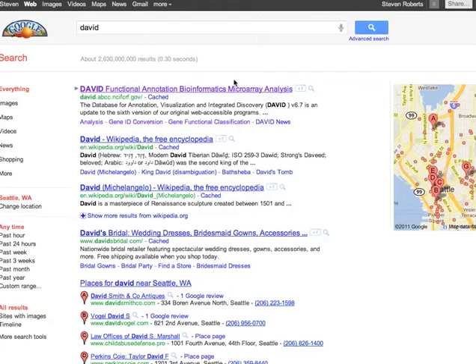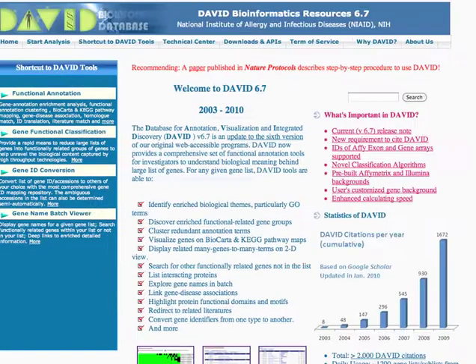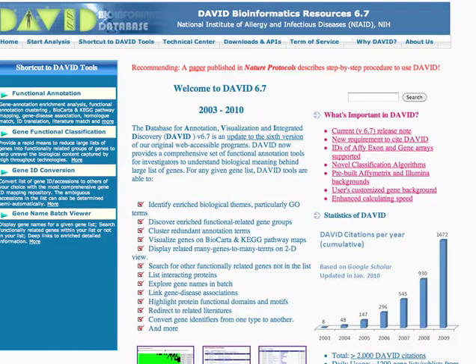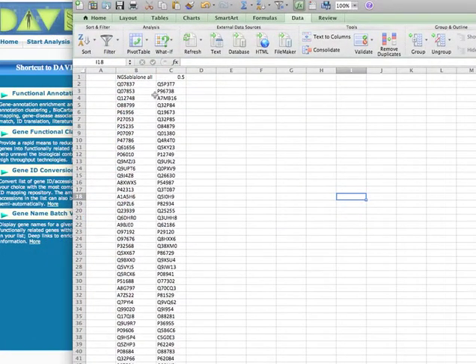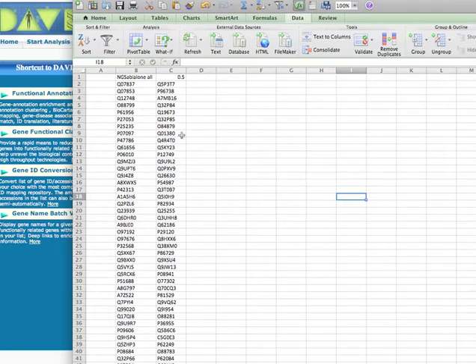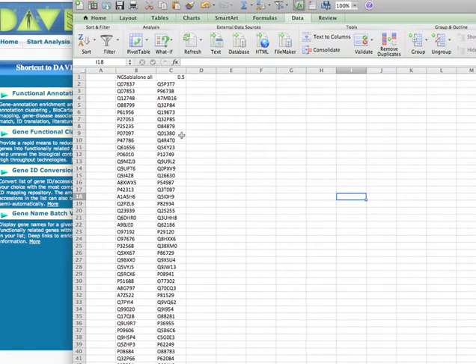And Swiss Pro term, right? Yeah, so what I did is I took all of your Swiss Pro IDs for all of your annotations and just made a list of those, just non-redundant. Then I took a list of your Swiss Pro IDs that were from the differentially expressed genes, and I have these two lists now, okay?